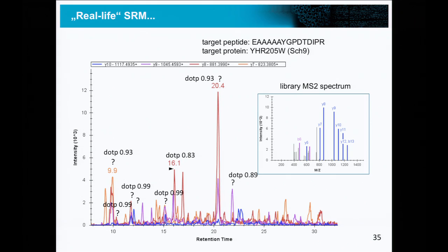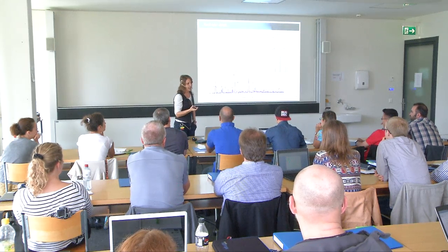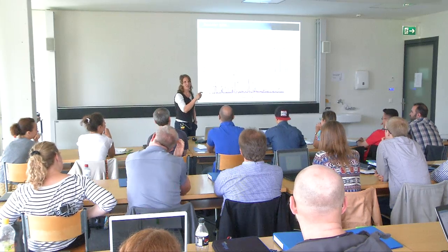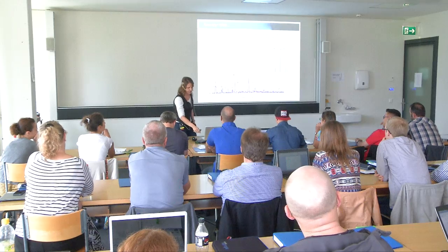Sorry? Retention time? Heavy standard. Both correct, exactly. Retention time or heavy standard. And heavy standard is even the most powerful one that we have, even better than retention time prediction. You always have still some variability.